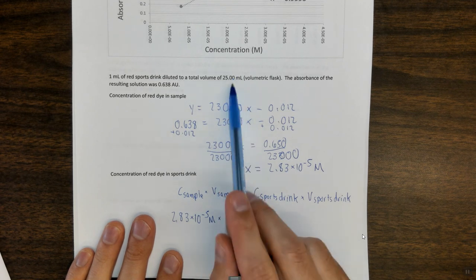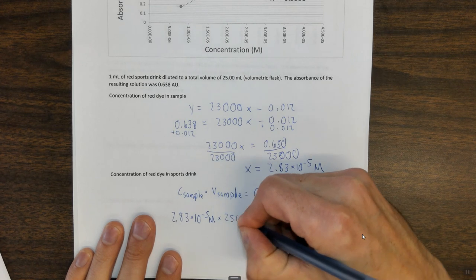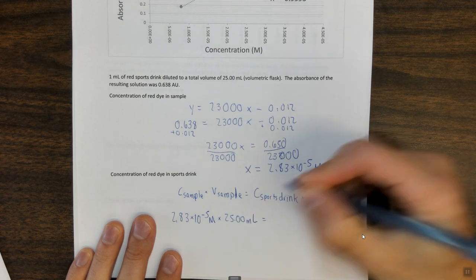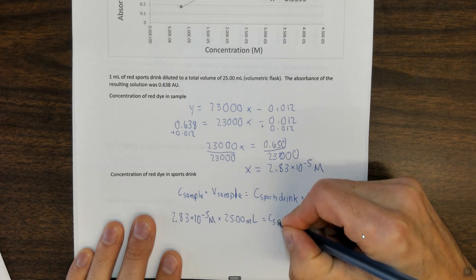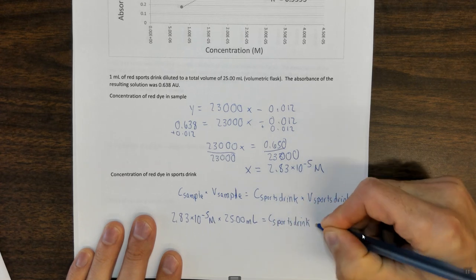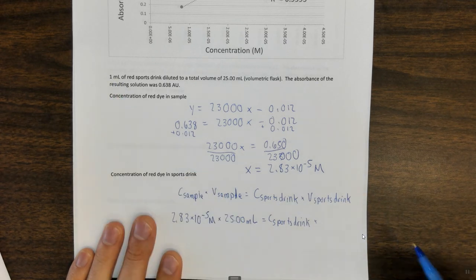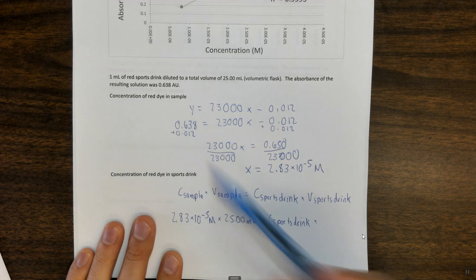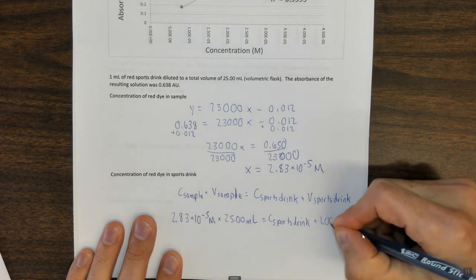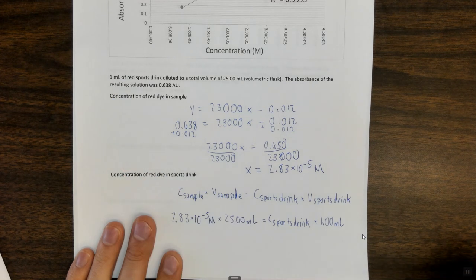That was the original solution that I used, so that was the total volume, 25 milliliters. Equals C sports drink, that's what I don't know, times the volume of the sports drink that I originally used, which was 1 milliliter. Now, because I'm going to use a pipette to do this, it's going to be 1.00 milliliters. Poor wording here. I should have put 1.00 milliliters.